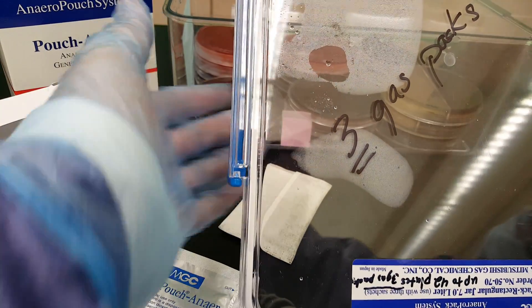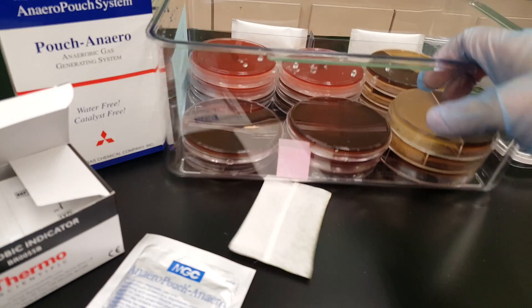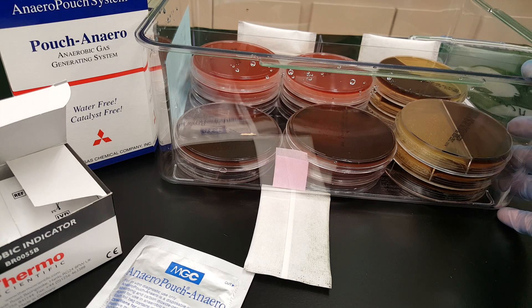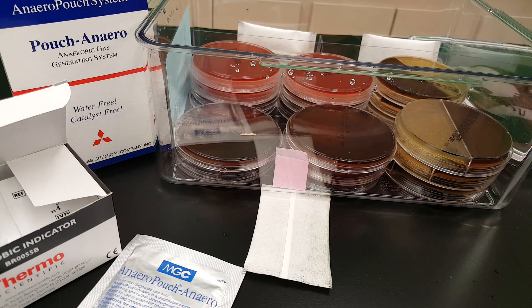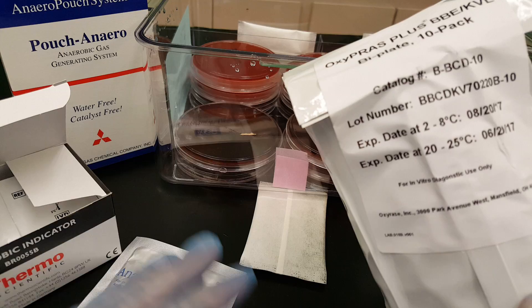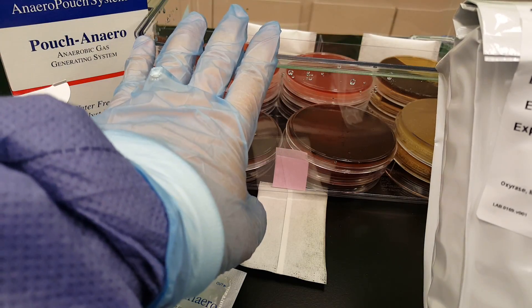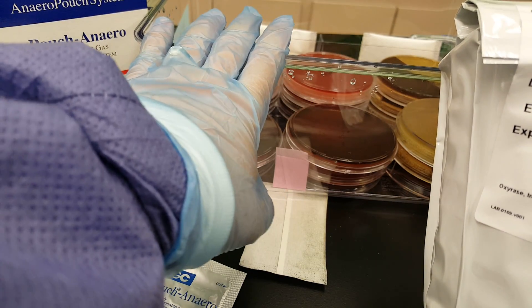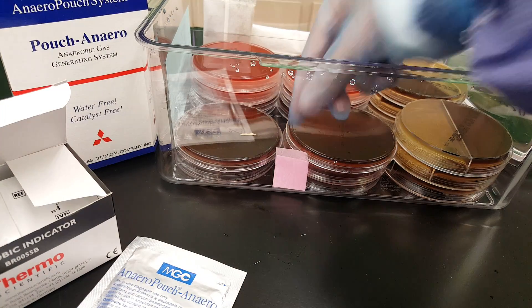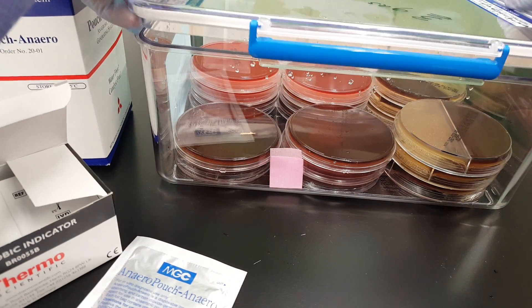This has condensation because I had it in the refrigerator. This large container holds up to 42 plates and will be used whenever you open a new container of plates and don't use the rest. You'll put the unused ones in the container, put the three gas packs in there, and put the indicator in there.